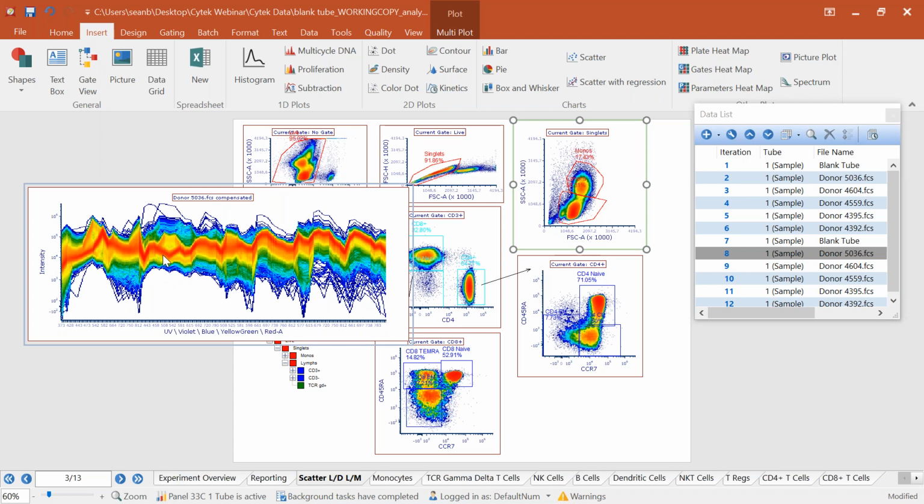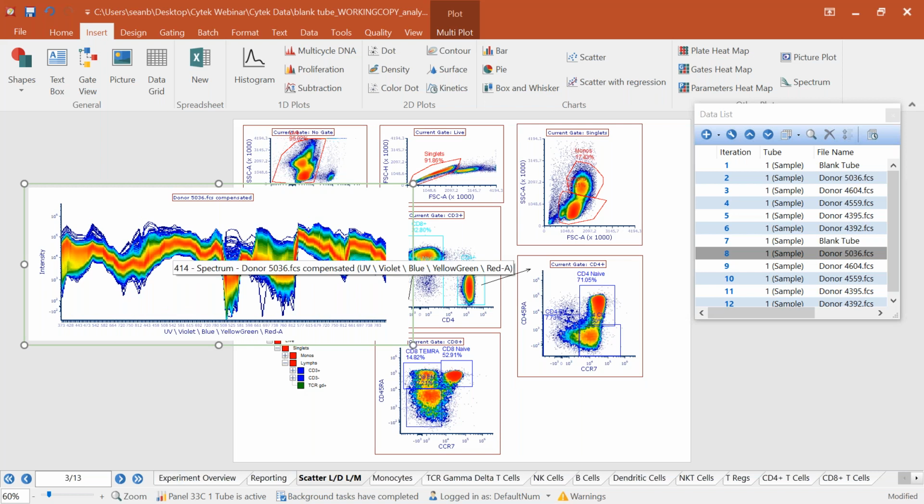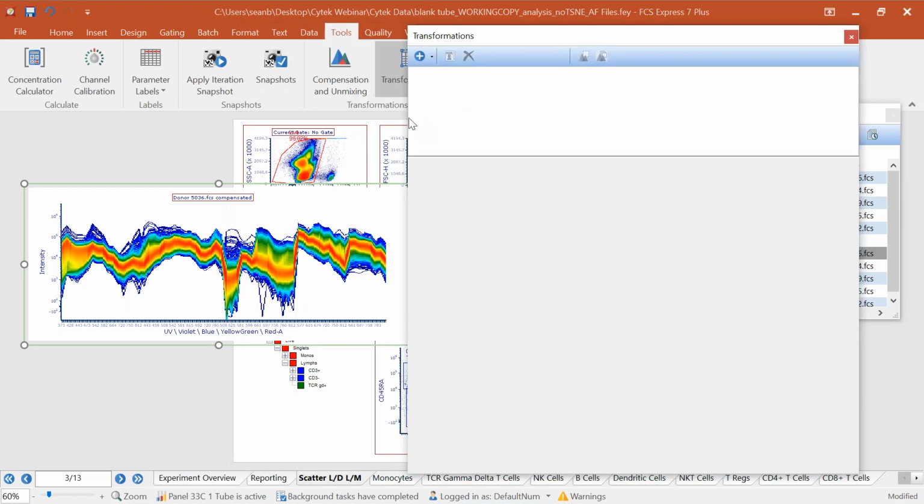We can apply this here. We can see what the lymphocytes spectrum looks like. If we want to drill down and get into, say, these CD4 naive cells, see what that spectrum looks like, right? We can actually go in and do that for any of these populations. You can create overlays. You can create multiples of these plots.